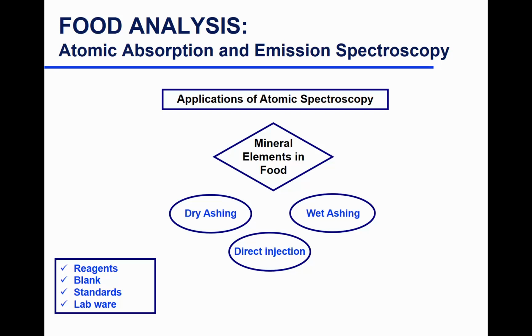Sometimes you can do direct injection. That is only for samples where you don't have that much interference with the organic matter. It's very uncommon.